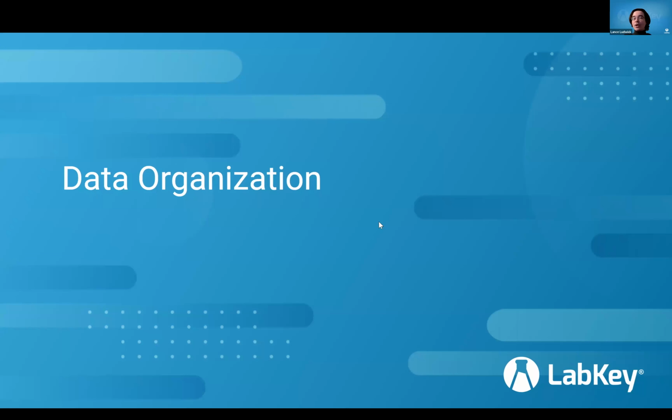This is something we want to do when we're first setting up Sample Manager, but it's always something you want to revisit to see how you can make improvements to your workflow, or if you're tackling new projects, new sample types, or if you just want to grow with your use of Sample Manager. And don't worry, you don't have to do this alone. This is something we can do for you or with you, based on our experience, what you need, and what we think may work best for you. And that's when we can really work together.